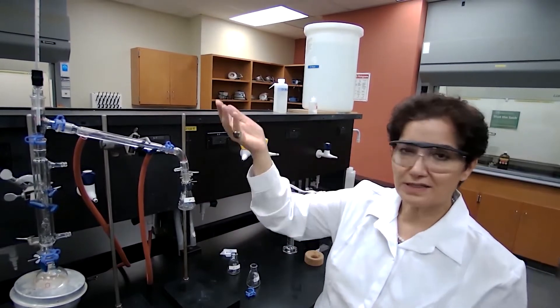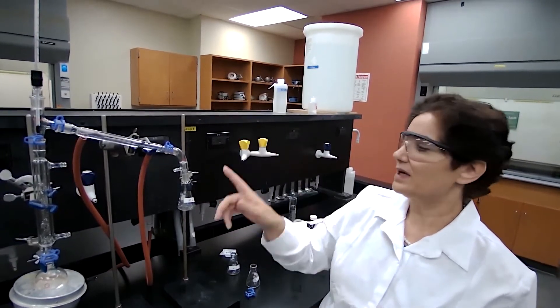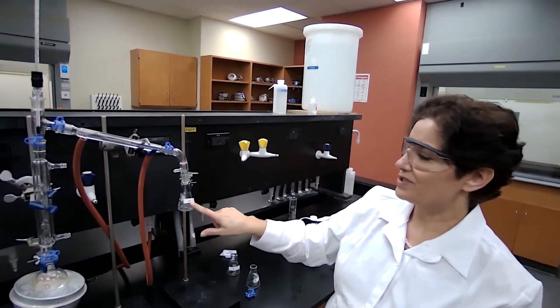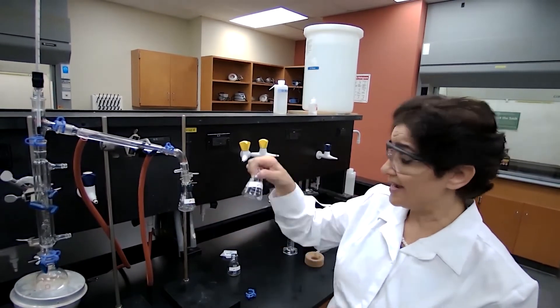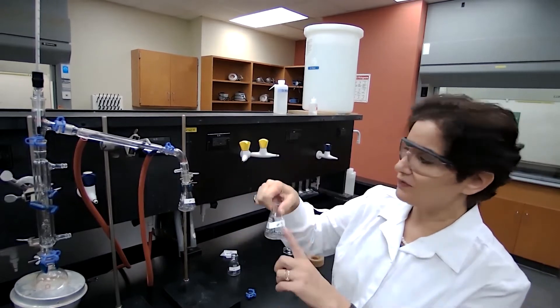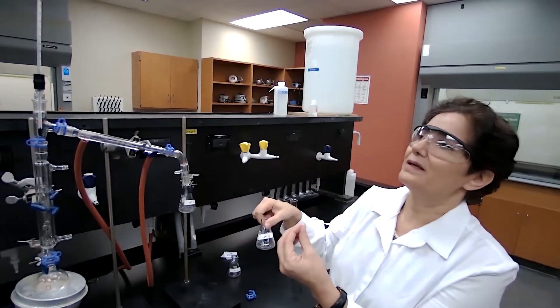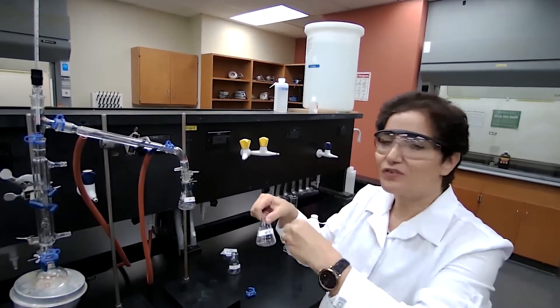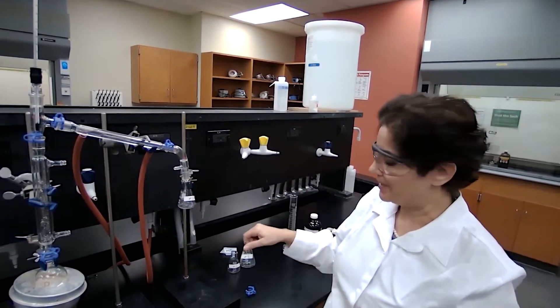When the temperature increases or starts increasing, I'm going to switch the flask from fraction two to fraction three. And in this flask, I'm collecting the sample that I don't use it, but it's like between the two samples. So it could have some contamination.